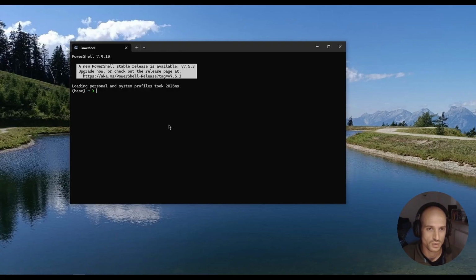On Mac, you have to use the terminal app. On Windows, I recommend installing Miniforge and using the Miniforge prompt. Here, in my case, I'm using the PowerShell, but it really doesn't matter. So we go ahead. Usually, I recommend using a conda environment. So for that, we type conda activate ACDC, which is where I have SpotMAX installed. And then to run SpotMAX, you can either run it through ACDC or directly by typing SpotMAX. In this case, we go through ACDC, which is anyway recommended.